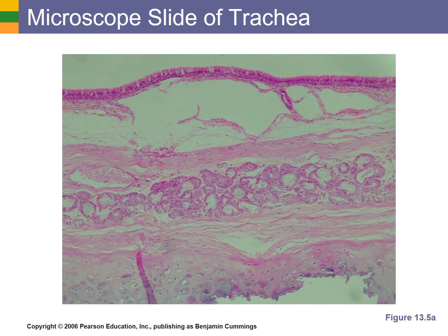This is a slide of the trachea and we're going to start on the lumen side. Here's our open space. Recall that pseudostratified columnar epithelial cells line the lumen of the trachea. You can identify them by looking at the cilia here. Also notice that the nuclei bounce around a little bit. Notice that we have goblet cells — everywhere you see this little sort of off-white area, that's mucus being produced by the goblet cells.